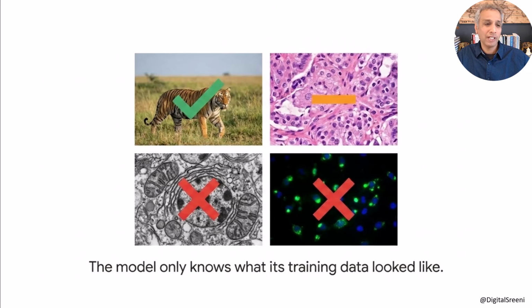And in fact, if you have cellular images with different markers, let's say green representing the cytoplasm, and let's say blue for the DAPI signal, then there are better models to detect those, not this specific approach. Go ahead and use Cellpose, or go ahead and use StarDist, for nuclei segmentation, or even labeling, if you want to call that.